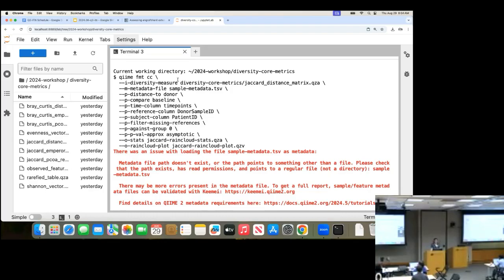This is one of those error messages where I've seen it so many times that when I hit it, I'm like, oh, I'm in the wrong directory. It doesn't say that to me at all. But when I see it, I'm like, oh, where am I? I apparently don't know because I'm pointing out something that I thought was here and it isn't.